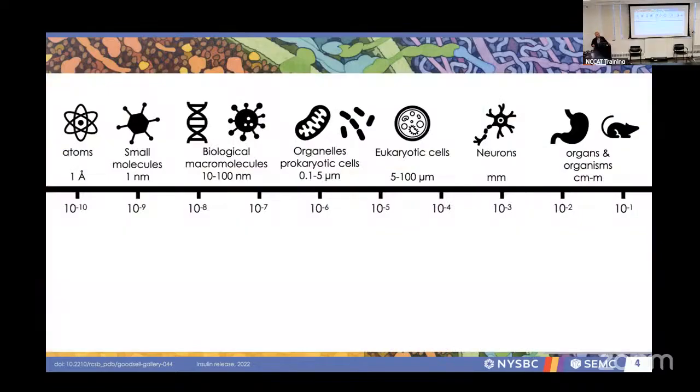And I think one of the most robust forms of the workflow has been our instrumentation. It's come a long, long way since I first started in EM to where we are now. The main thing that we can look at, and I sort of synopsized this a little bit yesterday, is that the scale of biology spans from the atomic level all the way towards the organism level.